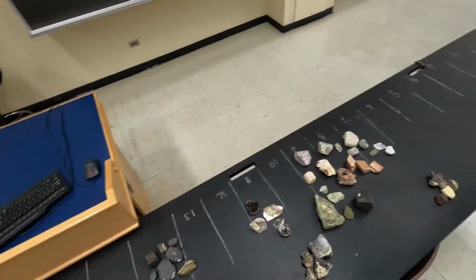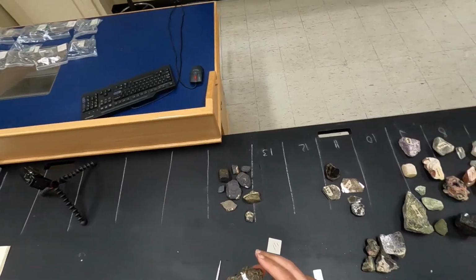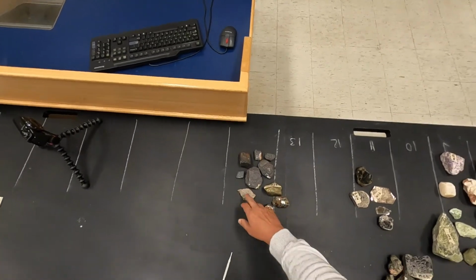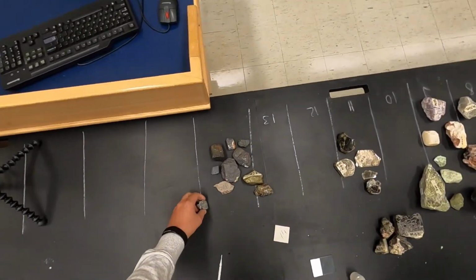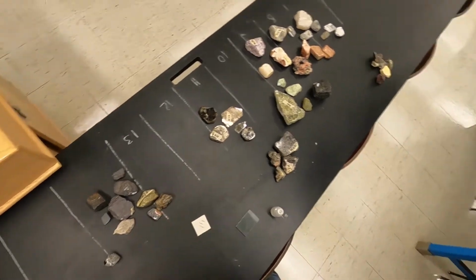This is a zinc sulfide, and so it's going to be classified as an opaque mineral with other sulfides like pyrrhotite, chalcopyrite, or even galena, which we were looking at before. So that's another sulfide.